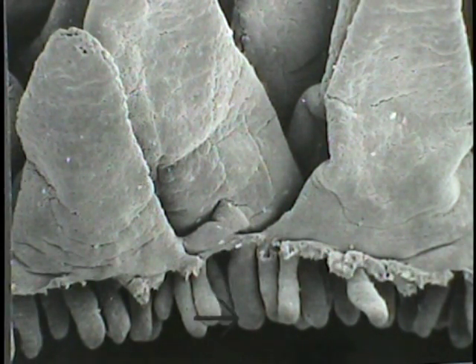So each one of these extensions down from the floor of the intestine shows the crypts of Lieberkuhn, or the intestinal glands, and their relationship to the villi. The orifice of one of these little crypts is shown at the tip of the arrow. So this is a quite spectacular and interesting scanning electron micrograph.